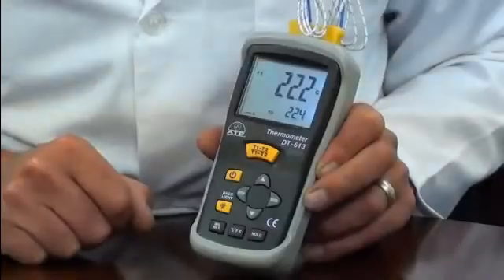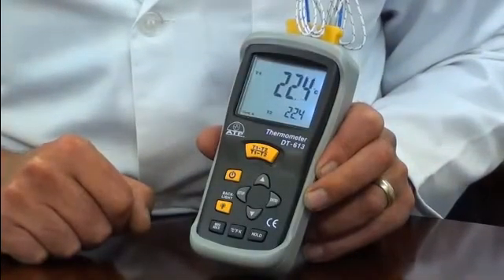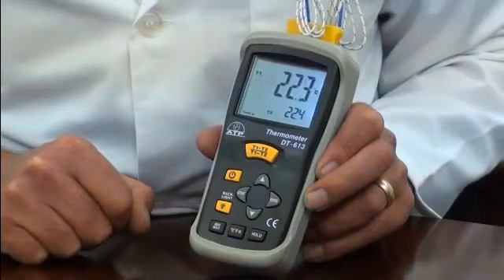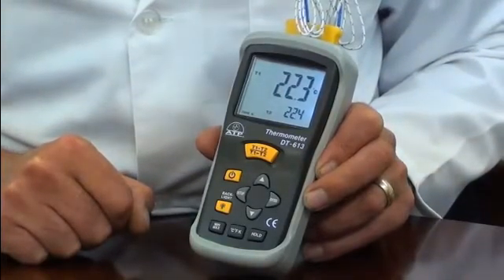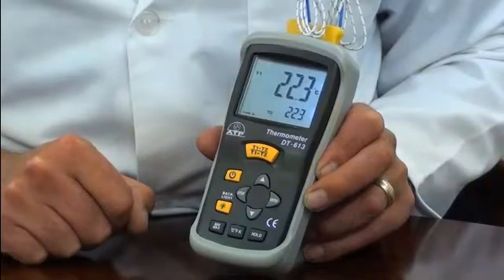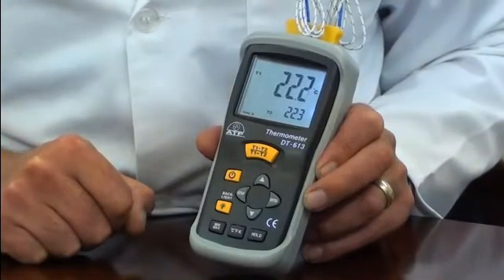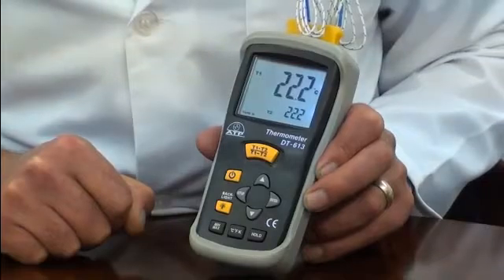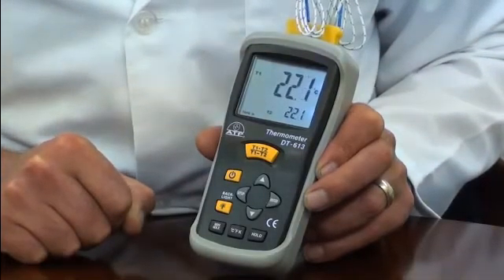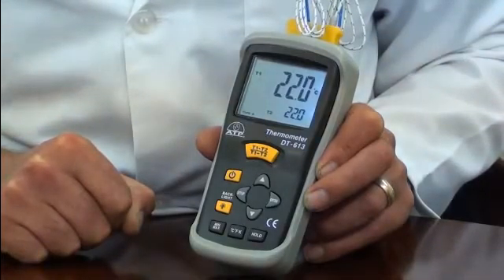It has a measurement range from minus 200 degrees to 1372 degrees C, with an overall resolution of 1 degree, but has a selectable resolution of 0.1 degree or 1 degree below 200 degrees. The thermometer is high accuracy, being plus or minus 0.15% of reading, plus 1 degree C, above minus 100 degrees.